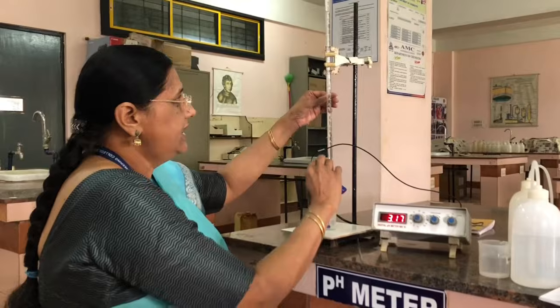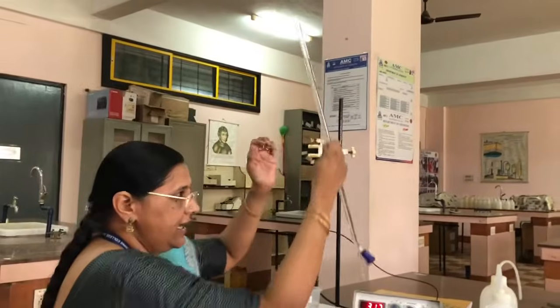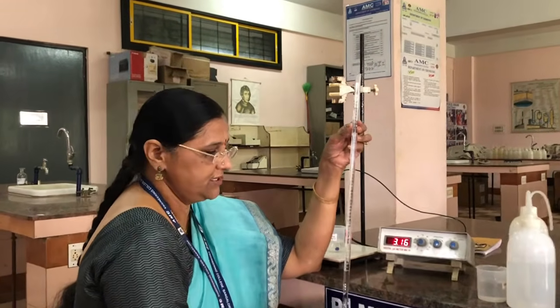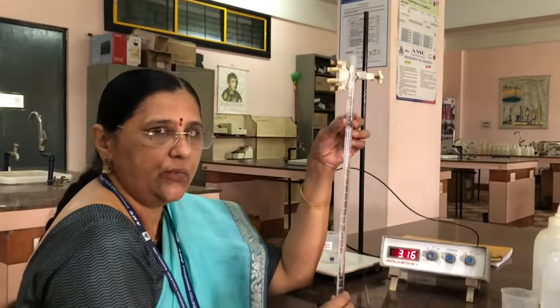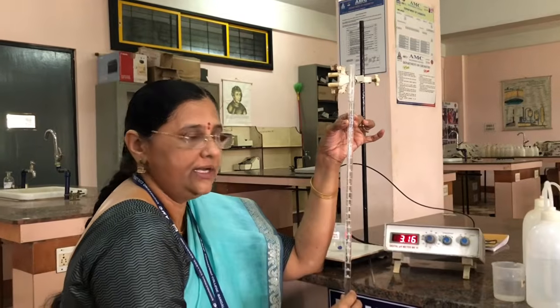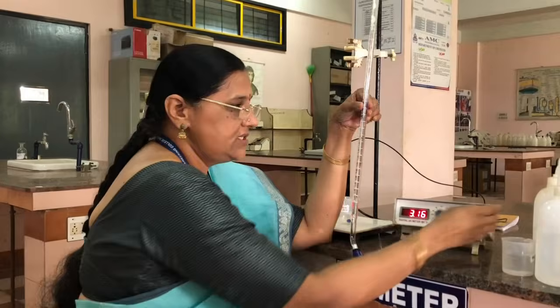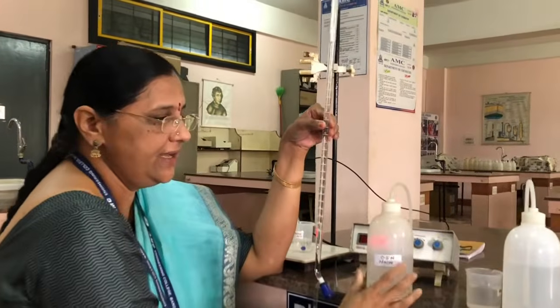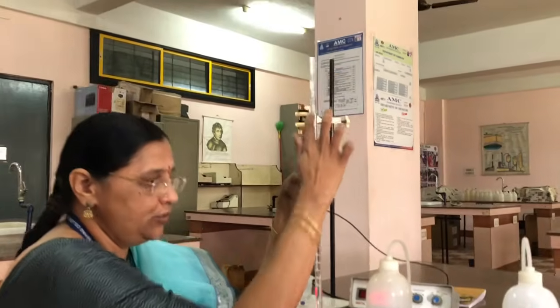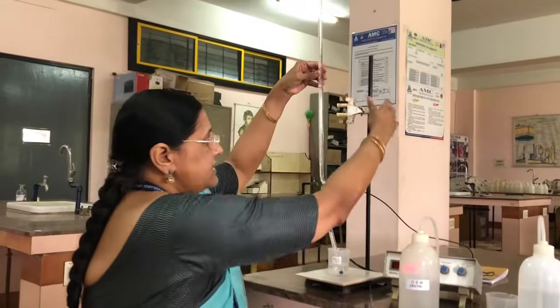Okay, now we are taking a burette to do the experiment, and this is unlike a normal burette. This is called a micro burette, and the capacity of this burette is only 25 ml, whereas in titration experiments you will be using a 50 ml burette. Now we are using only a 25 ml burette, and this burette is filled with 0.5 normal sodium hydroxide solution carefully up to the mark, and see that the nozzle also should be filled with sodium hydroxide solution.